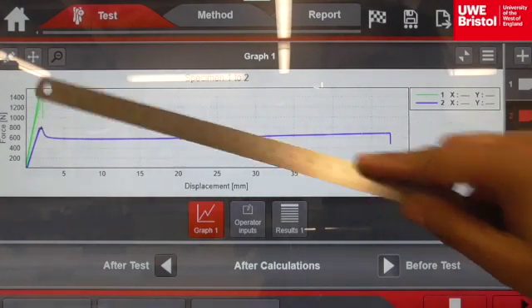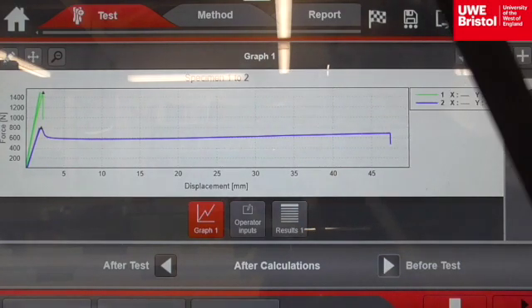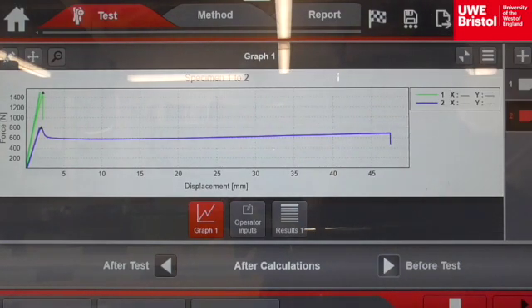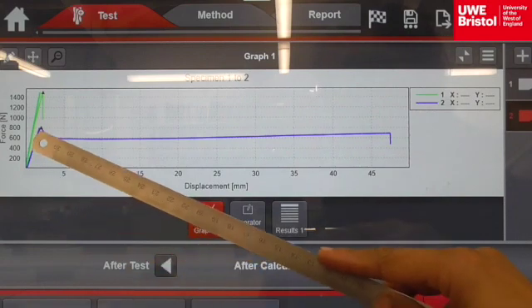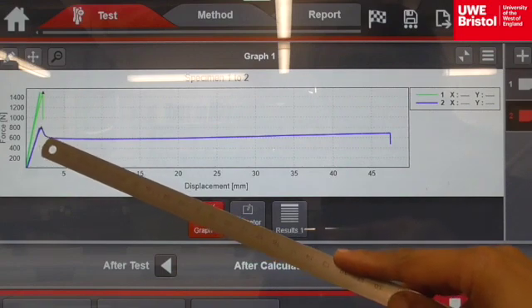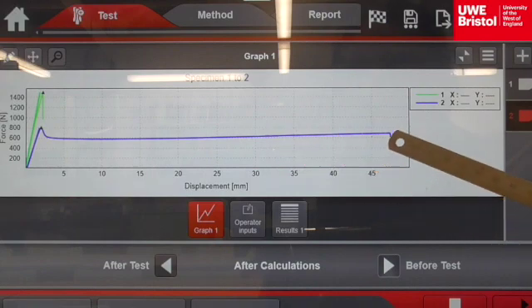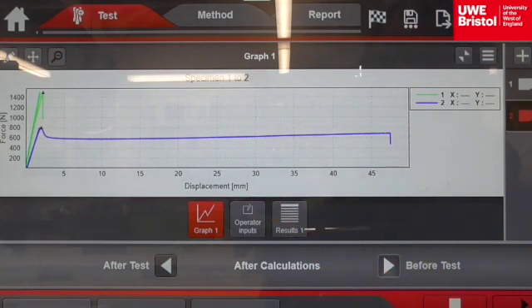polystyrene has greater strength. Also note, unlike metals, polymers don't always head towards fracture once the load against elongation begins to fall. In the case of high impact polystyrene, the forces required to maintain the rate of extension dropped, then plateaued for a significant period of time, then the load began to increase once again before it eventually fractured. The high impact polystyrene is also commonly referred to as toughened polystyrene.